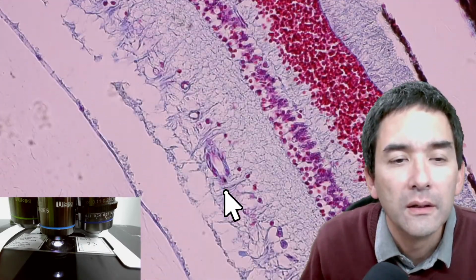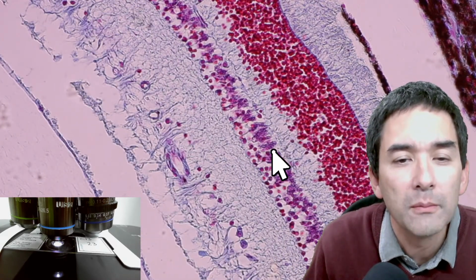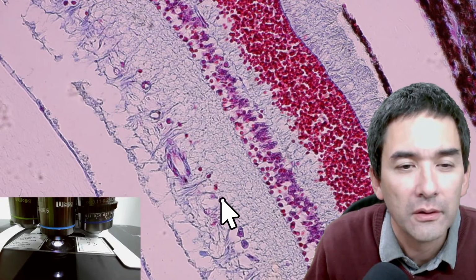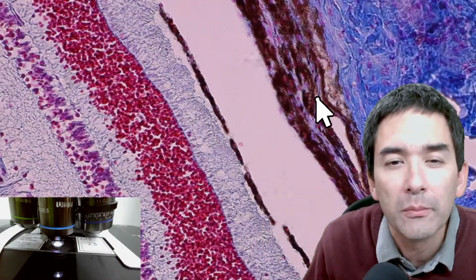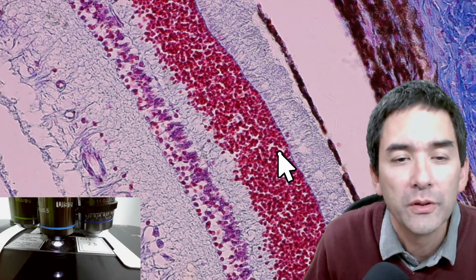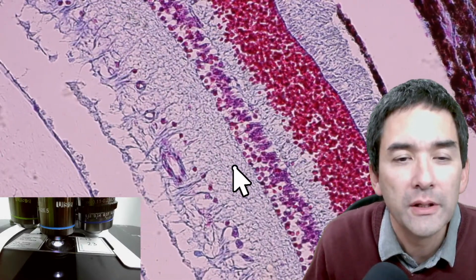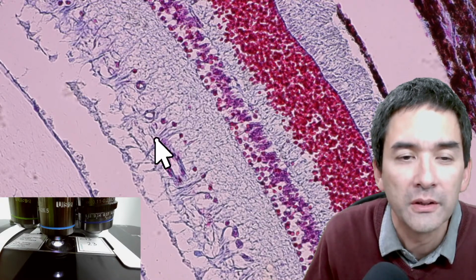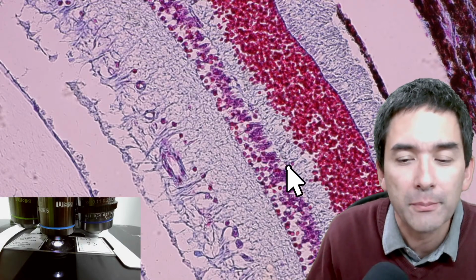Again here, it could be that one of these here might be the photoreceptor layer. Then there's a ganglion layer, maybe that's the one over here. And somewhere inside, either this one here or this one over here might be the layer of darkly pigmented cells, the choroid, which reduces the internal reflections. So actually the photoreceptor layer could also be this one here, because the light has to first pass through the so-called bipolar layer and the ganglion cells before it's able to reach the photoreceptors.